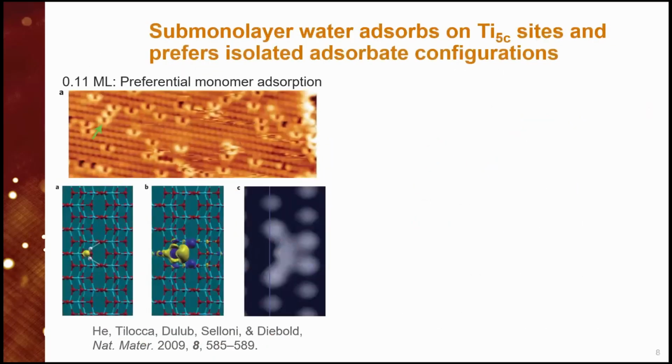Okay, so as you might expect, if you're going to talk about anything TiO2 here, Uli probably did the first stuff, and certainly often the best, almost always the best. So these are Uli's images of water monomers at low coverages on anatase, and she worked with Annabella Selloni, who, again, if you're going to do theory, is the go-to person. And basically what happens is the water adsorbs on the 5-fold coordinated sites, and then it adopts this parallel geometry, or symmetric geometry, where the 2 hydrogens are pointing to the adjacent oxygens on the row.